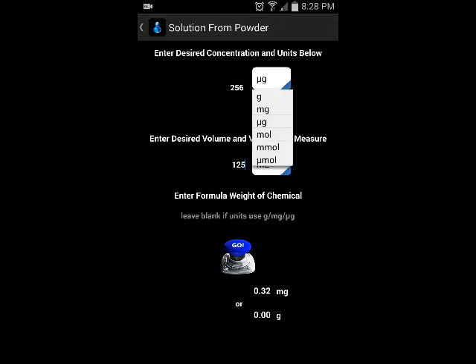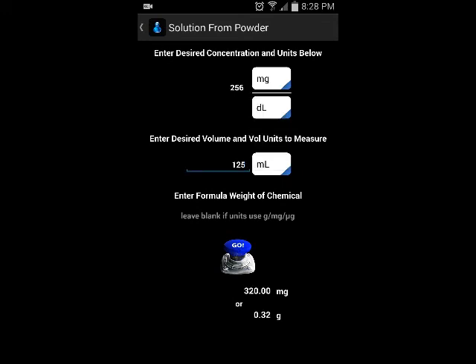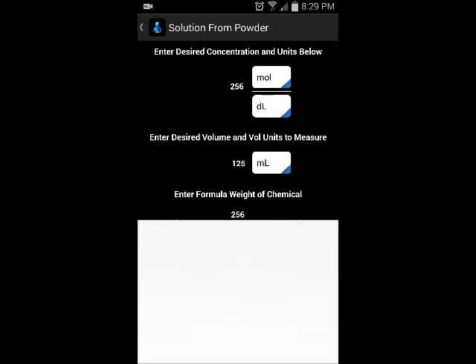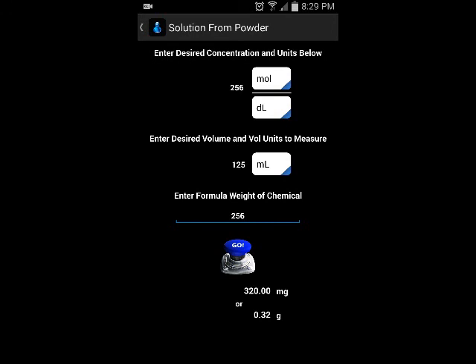We'd probably make that from a more concentrated solution, so let's go ahead and make a more concentrated solution — something more realistic, like 320 milligrams or 0.32 grams. It's up to you whether you want milligrams or grams. If we pick moles, it's going to prompt us because we forgot the molecular weight. Enter that formula weight — I picked something pretty realistic for a small molecule — and we get a large value, but you can use the gram value if you're measuring a large amount of powder.